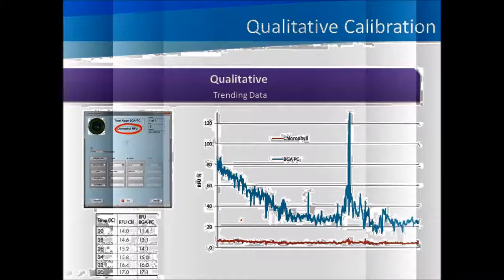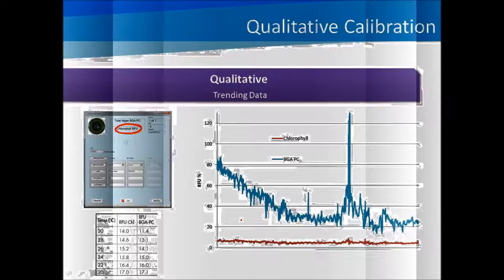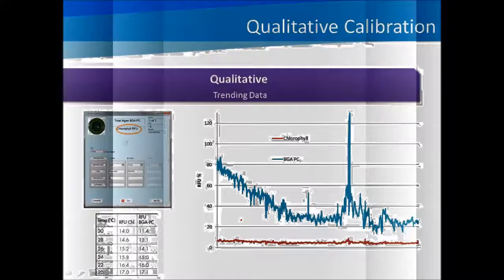Now, for the second cal point, we have a recommended rhodamine dilution as described in section 5.11 of the manual. And what this does is it serves as a secondary standard. Basically, a 0.625 milligram per liter concentration of rhodamine dye is approximately equivalent to 15.8 RFU, or 15.8%. And again, to calibrate, once the software shows stable, you accept this calibration and complete the process. And now we're going to go and log data in RFU percentages at all of your sites.